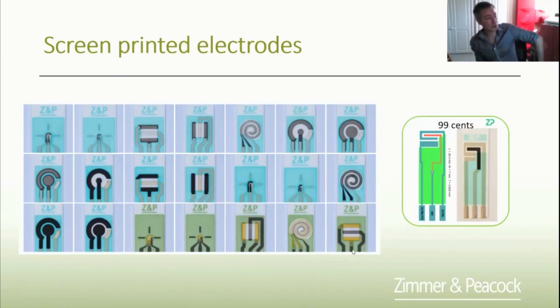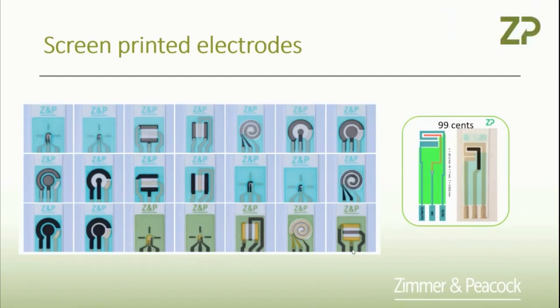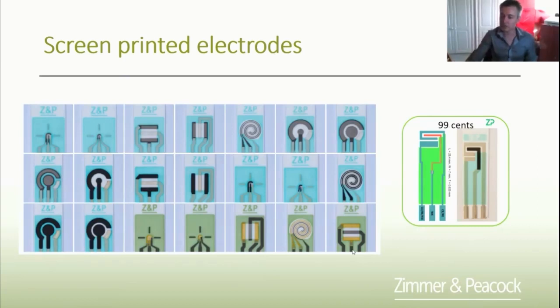If you were trying to do a sensor for something like a polyaromatic hydrocarbon, you could probably use platinum, gold, or carbon. But carbon would also be quite good for things like polyaromatic hydrocarbons, because for things that have carbon molecules in them, if you want to oxidize them or reduce them, then carbon as a surface for that is not bad. So we have lots of geometries depending on the application, and lots of metal types depending on the kind of assay that you want to run.